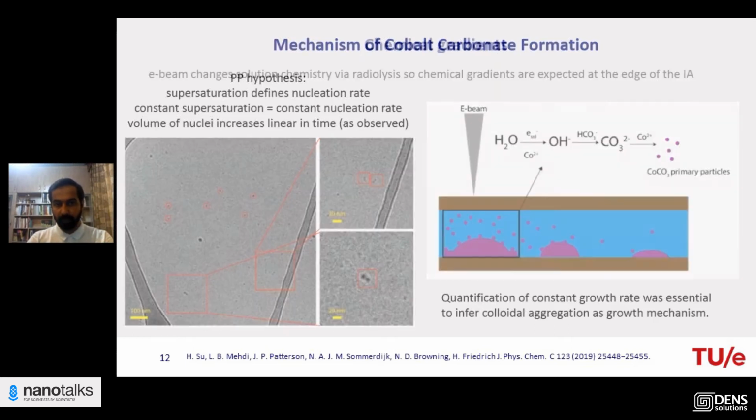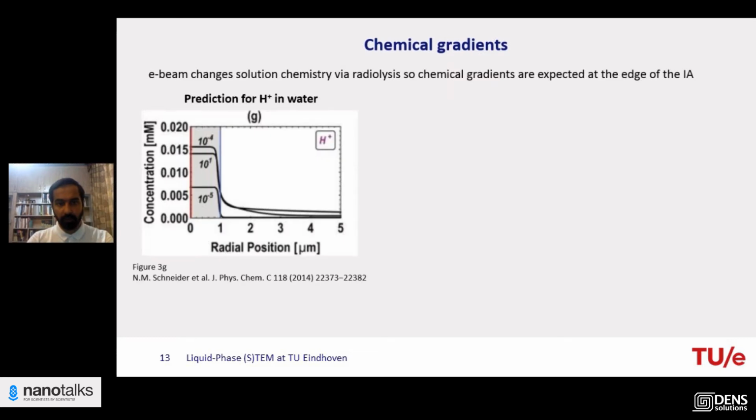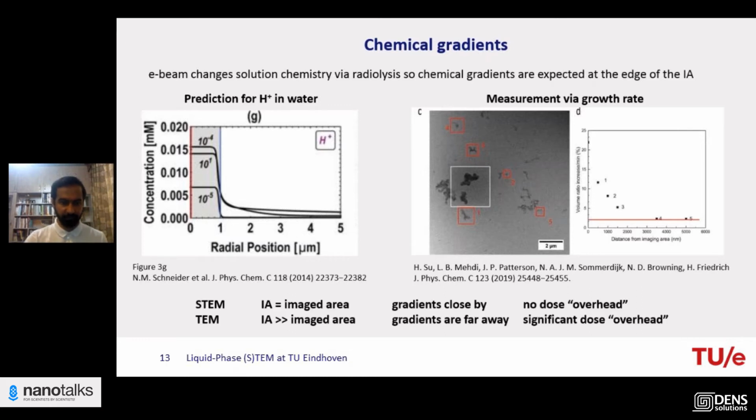Having this in mind, we should also say that there are things to consider when you are working with bright field or dark field for STEM and TEM.